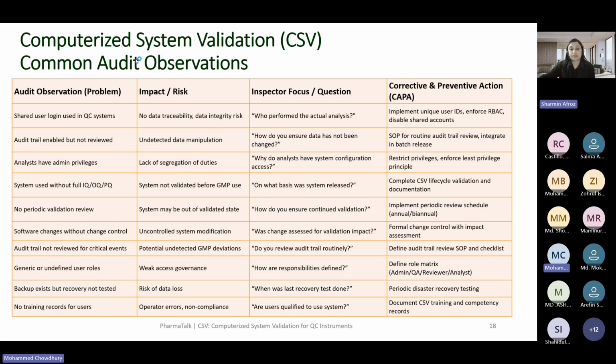The system policy, system settings, and user and administration changes can be checked on a periodic basis, like every 3 months or any periodic basis. But the audit trail generated during any batch should be reviewed before the batch release.